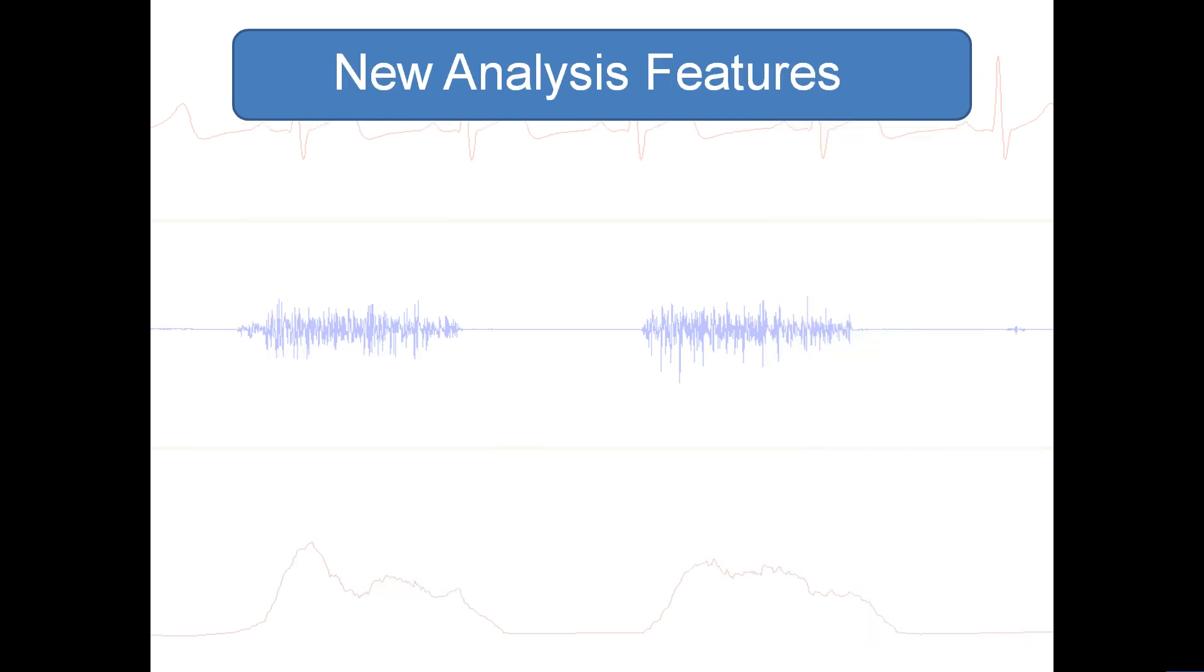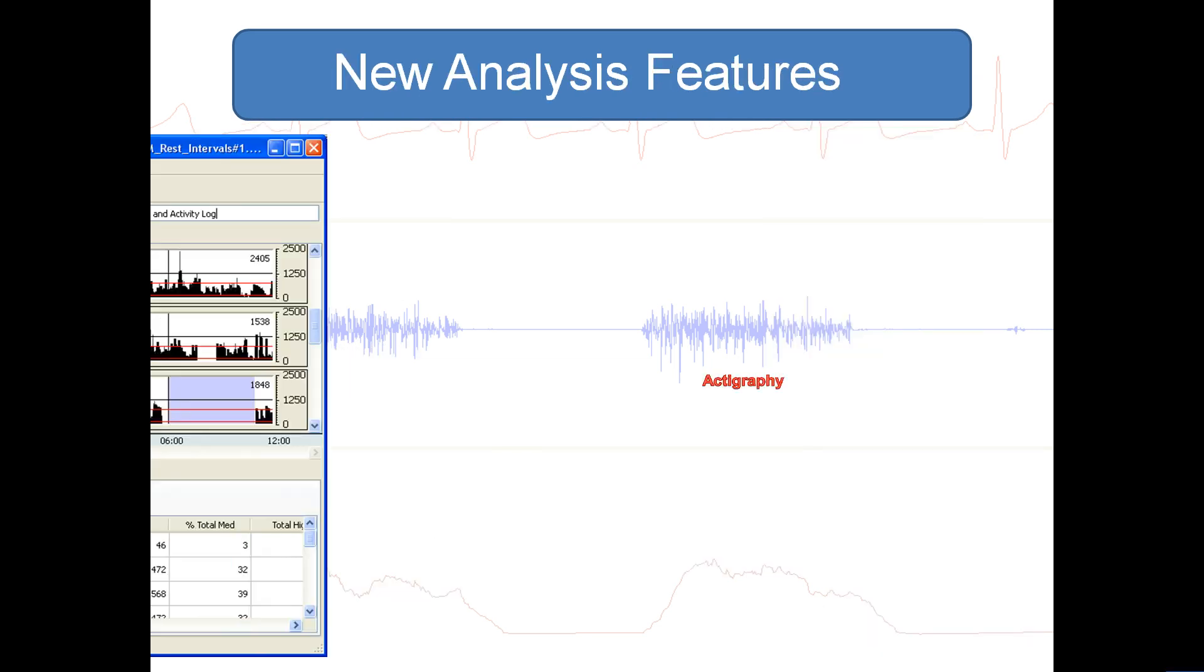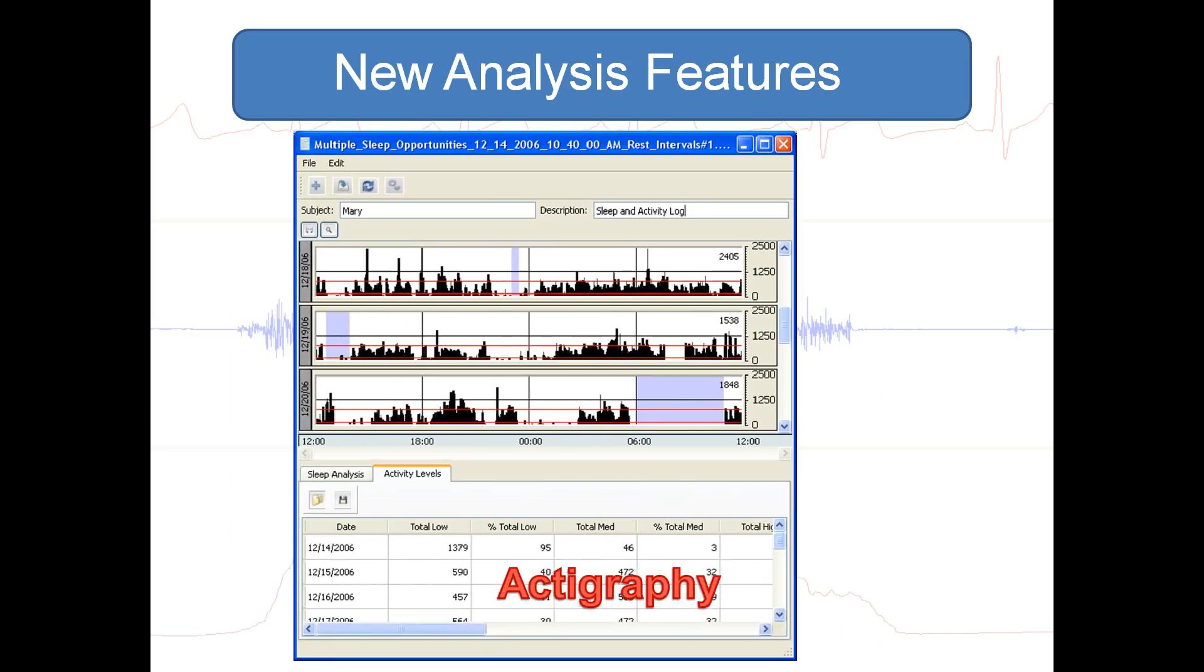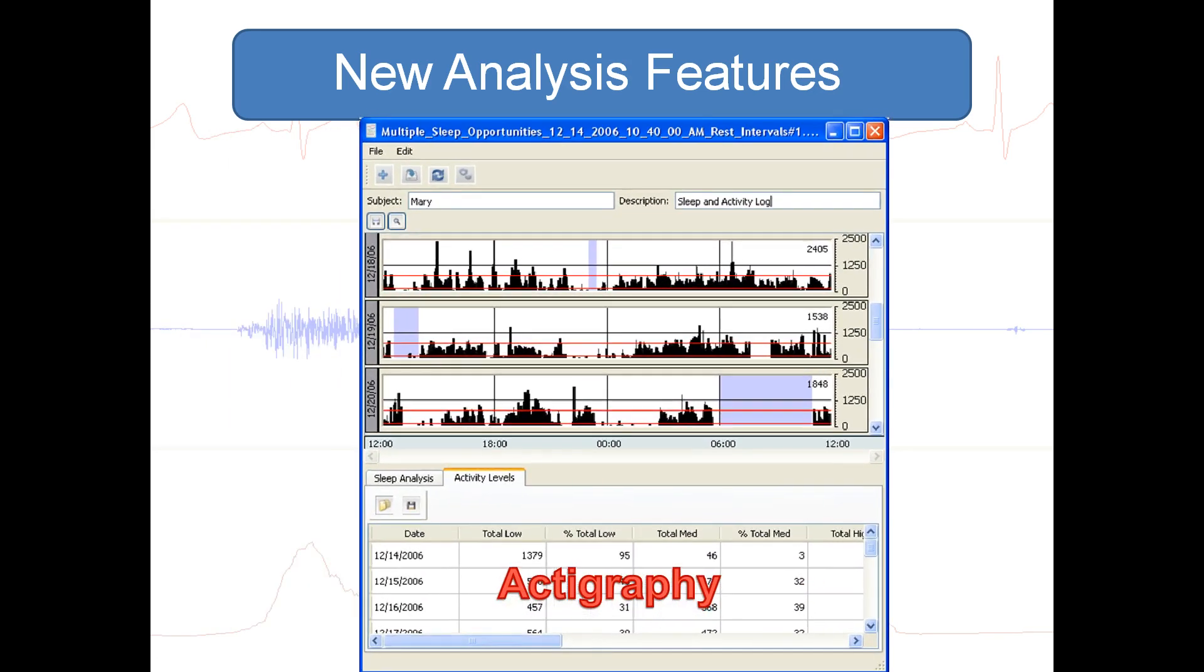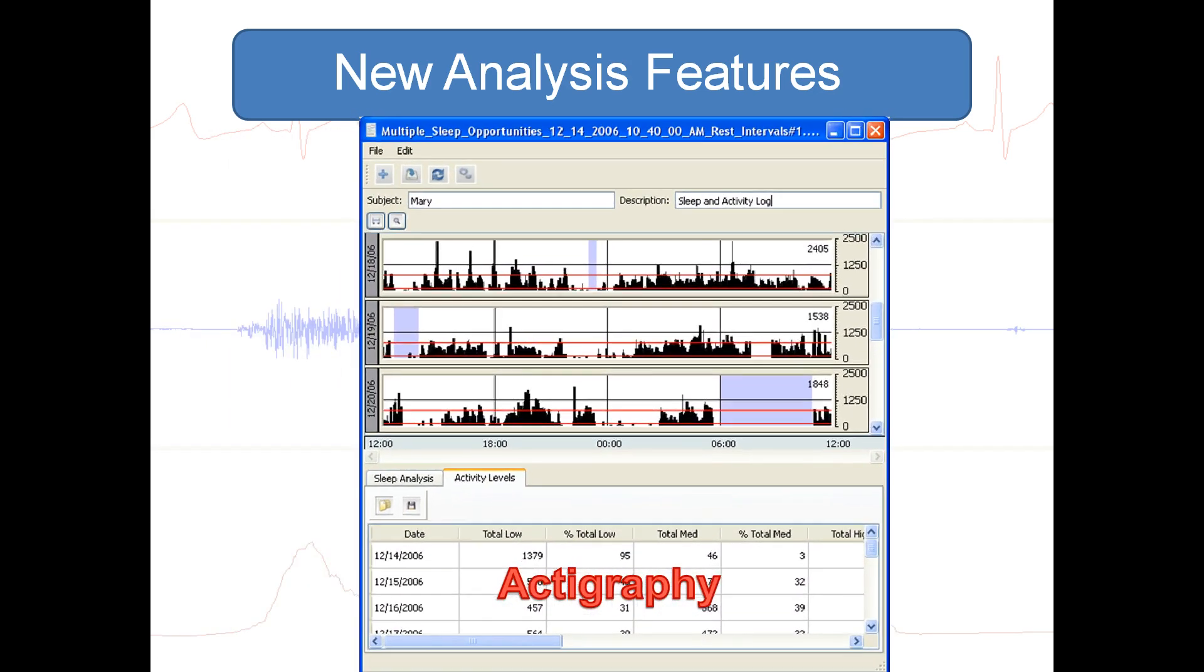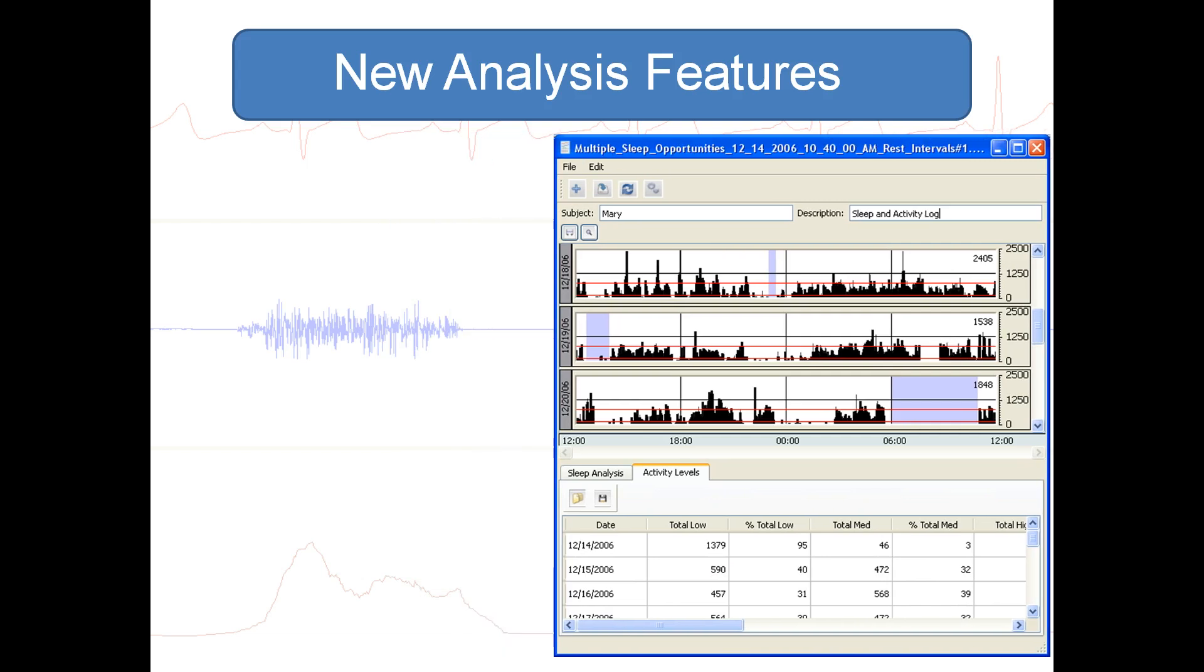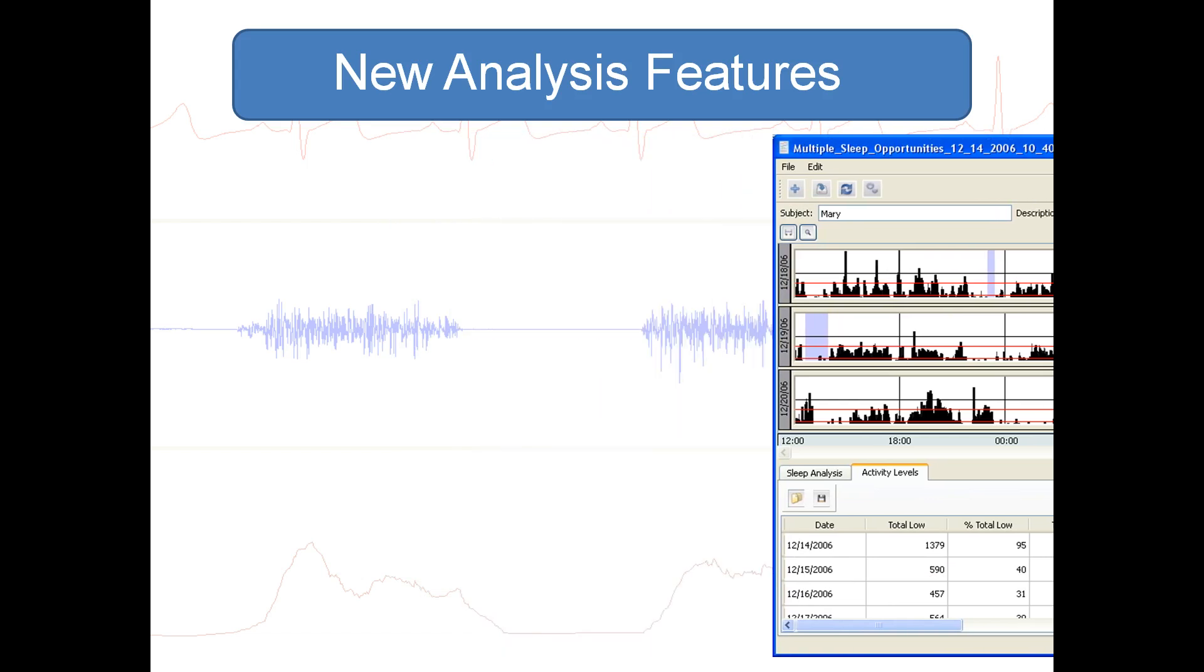New analysis features include actigraphy to monitor both sleep and general activity from participants over multiple 24-hour periods.